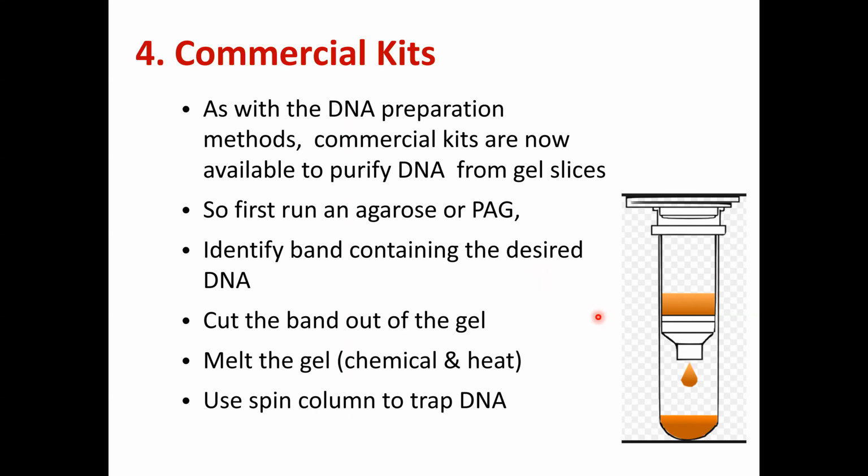So this actually just gives you some insight on the possible methods that you're going to perform if you're going to isolate or recover nucleic acid fragments.